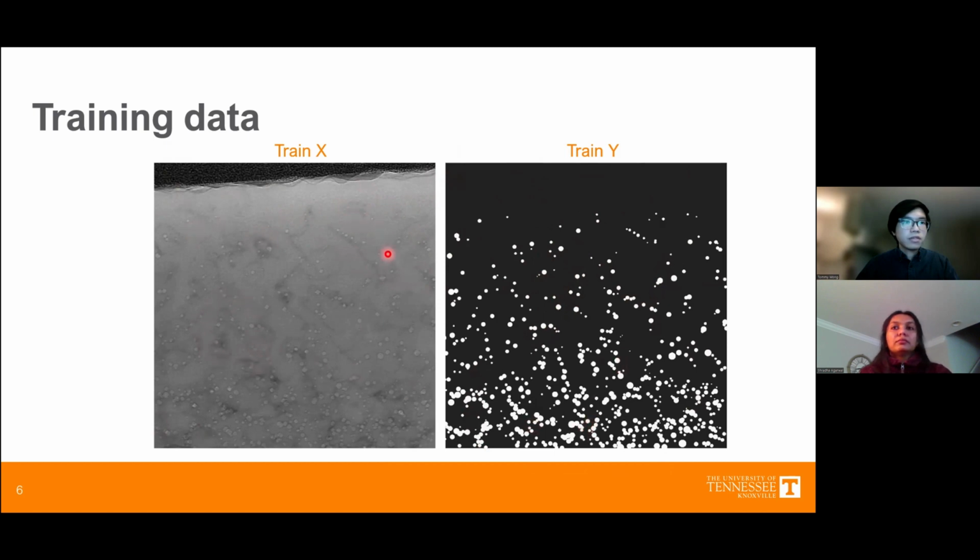So for example, in this image of TEM bubbles, the bubbles would be labeled in white or 1. And if said image is an image of dislocation loops of different kinds, these loops could have different integer values for different types of dislocation loops in different habit planes.